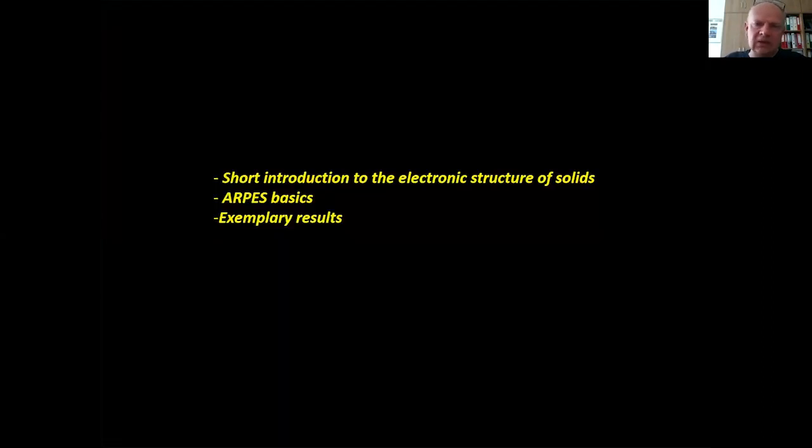So the plan of my talk is very short. At the beginning, I would like to give you an introduction to the electronic structure of solids, a topic with which you probably are familiar more or less. Then ARPES basics and exemplary results. I mean, ARPES is not a very simple technique, I would say. You have to combine several things, some of them quite advanced, to understand what's going on with this.